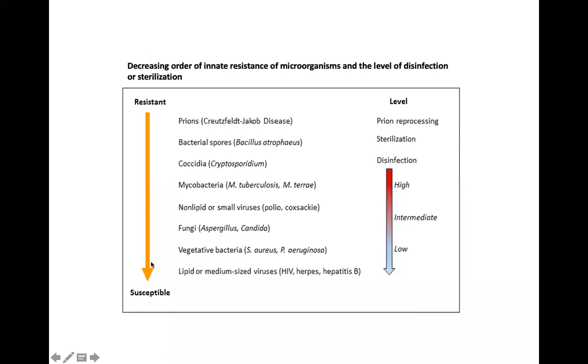This is basically the rule of thumb you'd use in a laboratory setup where you're trying to decide which chemical you can use. Labs can be classified as level one, level two, level three, level four, based on the risk of infection and the kind of work that is going on. If you're handling material, for example, from patients who have Ebola or other highly infectious pathogens, the kind of lab that you'd need to do that work would be different compared to somebody handling material from a patient who has Vibrio cholerae, for example, because of the risk of infection and the type of chemical you'd need to use to decontaminate or disinfect the surface after your processes. So this would definitely guide you. If you're in the infection control team, you can give guidance on the type of chemical you'd pick to carry out your disinfection process, or if you just need to carry out sterilization to decontaminate your surface after you have handled this material.